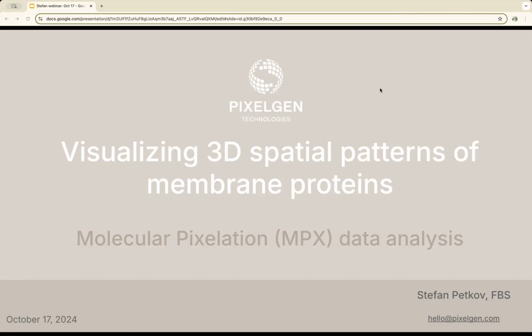So I'd also like to welcome you to this webinar. This is the second webinar in the series, and we have started this monthly series of webinars that we intend to keep going. And this one will be focusing on visualization. So specifically visualizing 3D spatial patterns using molecular pixelation data.